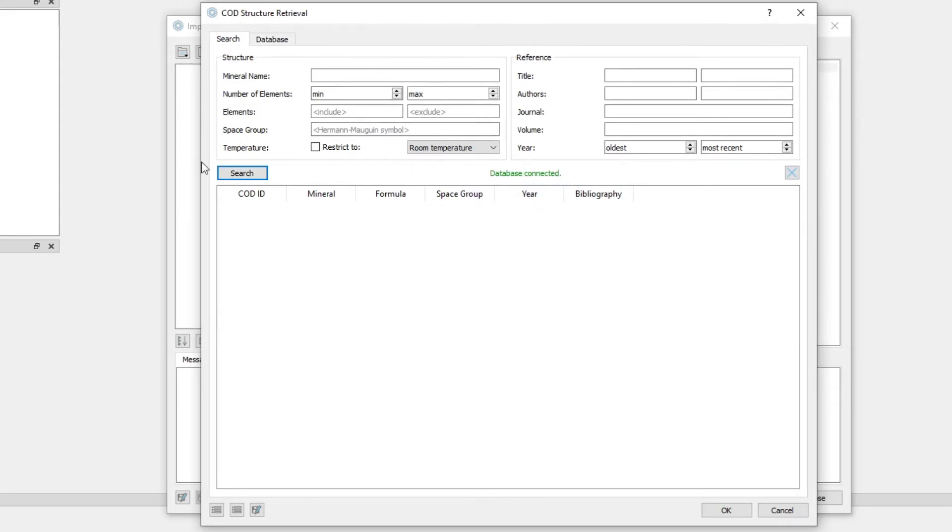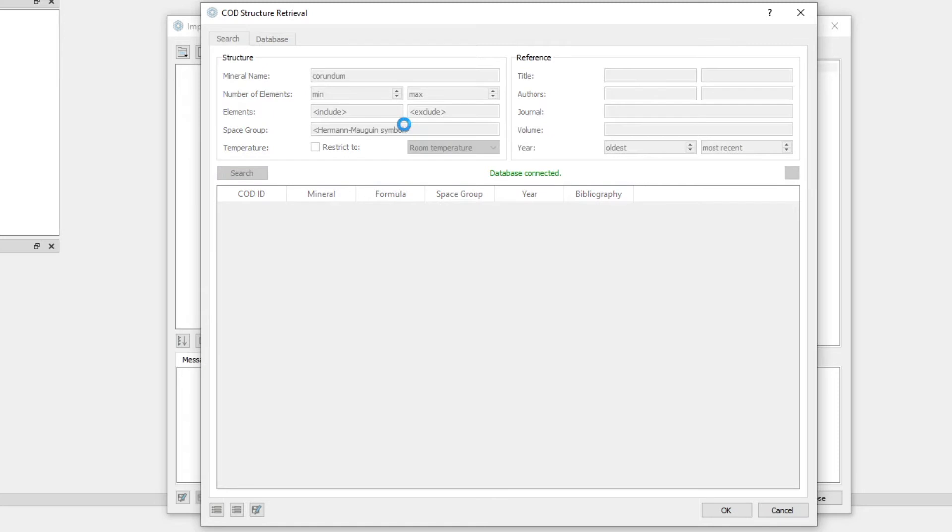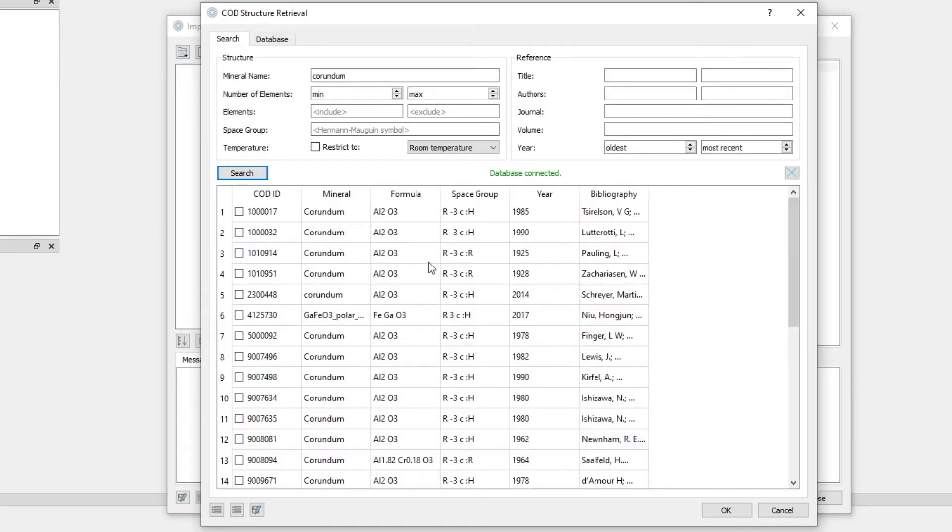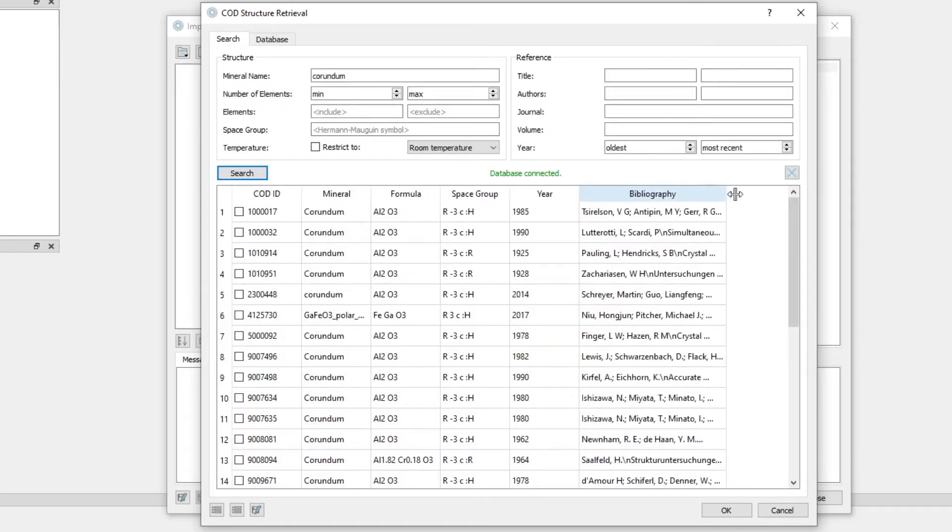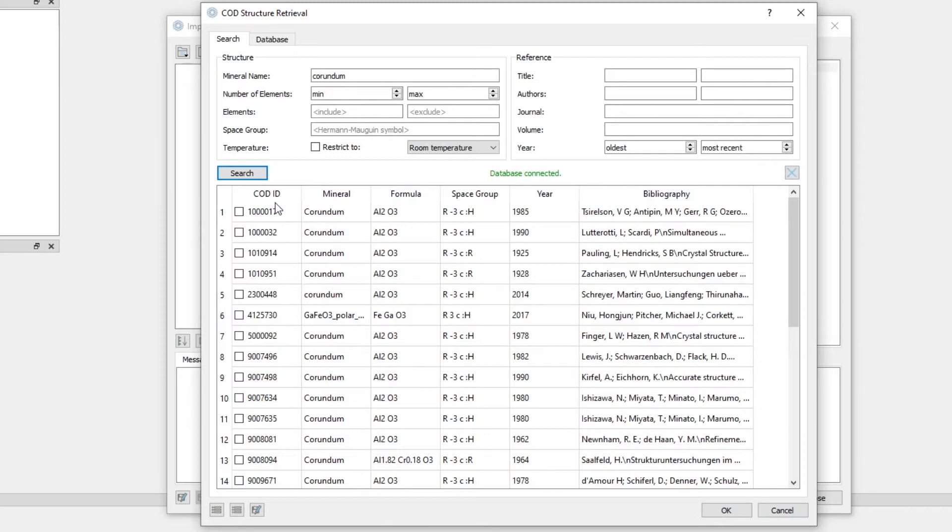Here in this form, we can search the COD database, for example, for a mineral name, Corundum. And it will give us all the entries in the COD for Corundum. And of course, we can refine the search. We can limit the number of elements to a minimum number or maximum number.